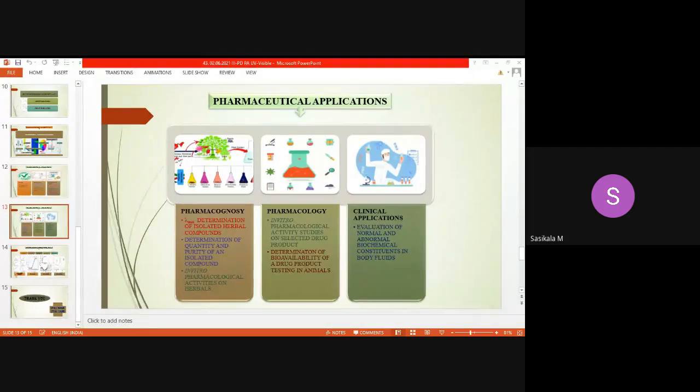Beer-Lambert's law, derivation, deviation, and limitations. You have written a test, right? All of you have written the test. You need to include some more points to score maximum marks.